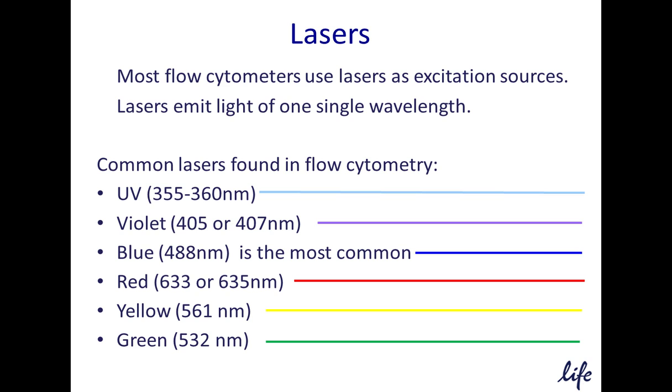Laser stands for light amplification by stimulated emission of radiation. It is a coherent light used by most flow cytometers to excite fluorescent dyes and characterize the particles as they pass through the laser beam. Here we see some of the most commonly used laser excitation sources. This is not an exclusive list. There are others which can be used, such as 550 or near IR wavelengths.